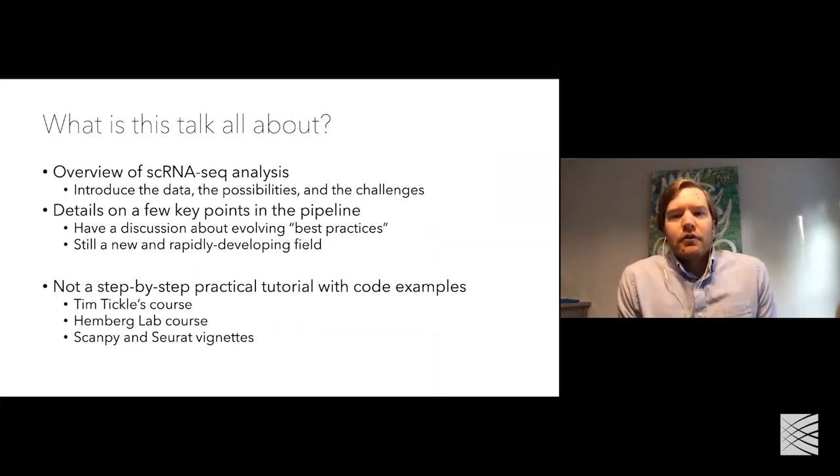So as a general overview, what do I hope to cover in this talk? It might be a little bit packed, but hopefully we can get through an overview of single-cell RNA-seq analysis. I'll introduce the data, the experiment briefly, different possibilities for data analysis and challenges that are sort of unique to the single-cell aspect of this data set.